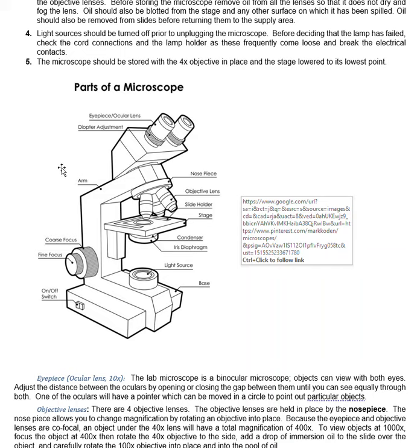So guys, here's a rule of thumb. You don't use the coarse focus except on the 4X and the 10X. When you get to the 40X, you should never use the coarse focus. You only use the fine focus. Because if you do, you're going to go crack. You're going to break the slide. Not a good thing.